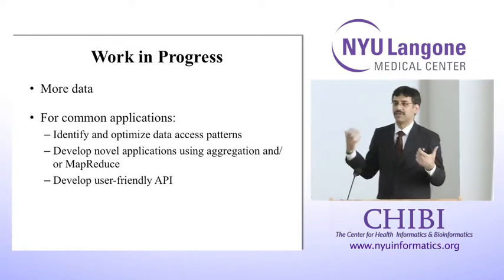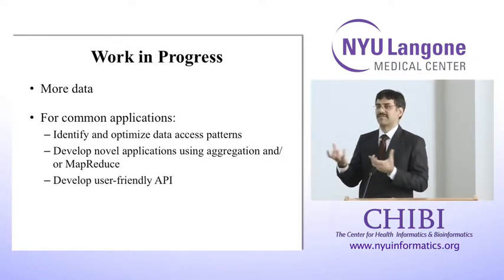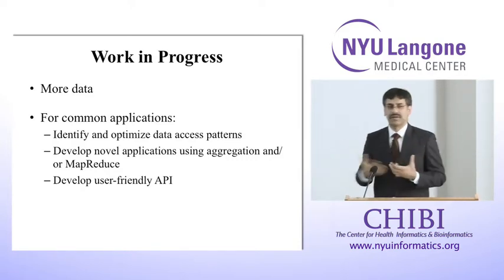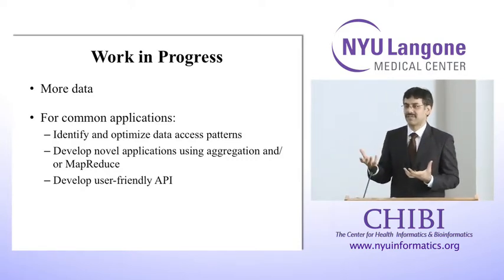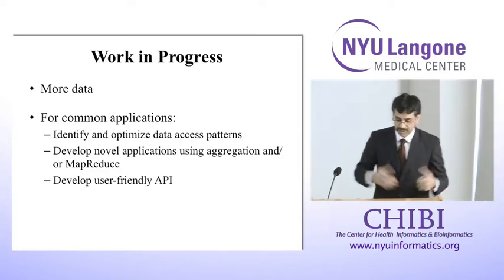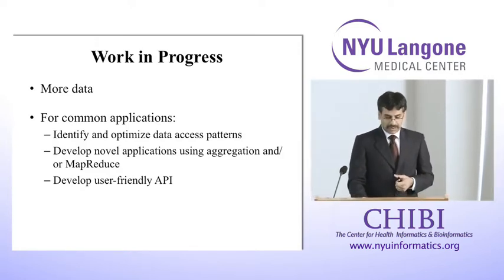I have used some pieces of mass spectrometry data, but there are a lot of other kinds of data in mass spectrometry that we can actually store in our database and do other kinds of analytics things. So that's one step.